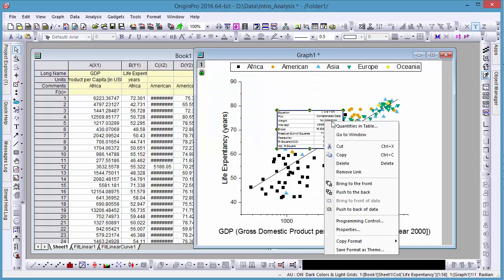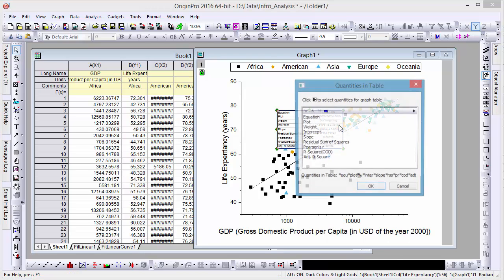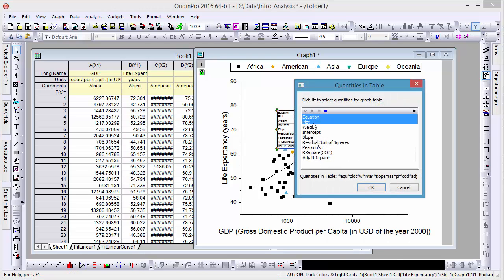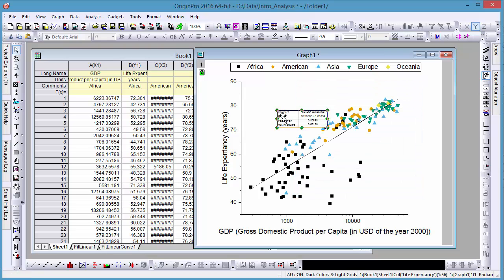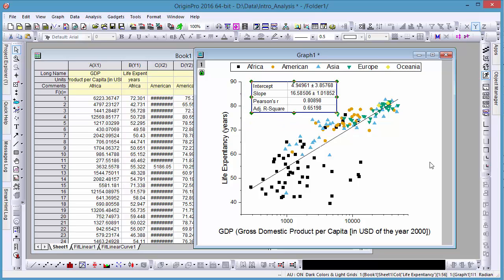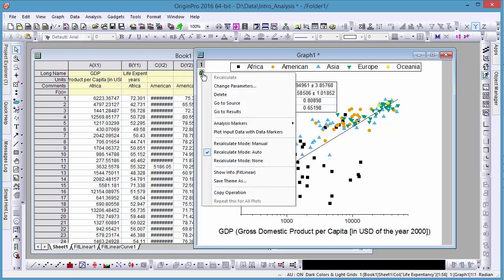The quantities displayed in this table can easily be changed by right-clicking and selecting Quantities in Table. Should you decide to change the parameters of the analysis, rather than starting from scratch, you can click on the recalculation icon and change parameters to reopen the fit dialog.